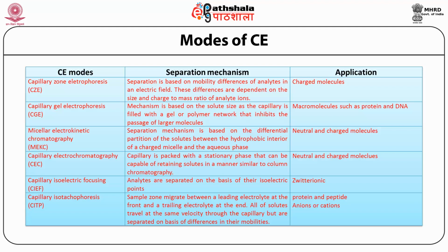Capillary electrophoretic techniques encompass separations in which the capillary contains electrophoretic gel, chromatographic packing or coating. The distinct capillary electroseparation methods include capillary zone electrophoresis, known as CZE, capillary gel electrophoresis, known as CGE, micellar electrokinetic capillary chromatography, known as MEKC or MECC, capillary electrochromatography, known as CEC, capillary isoelectric focusing, known as CIEF, capillary isotachophoresis, CITP.